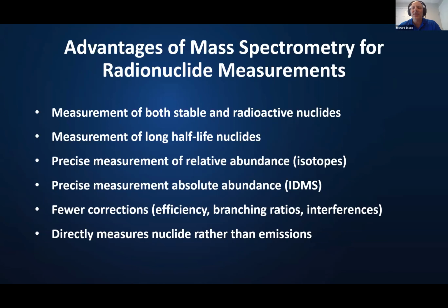I'm not exactly sure how he means it, but I think it's a fundamental point that having well-characterized half-lives, and I think there's another aspect of it, essentially traceably measured half-lives, is the link between numbers of atoms, obviously, and radioactivity.